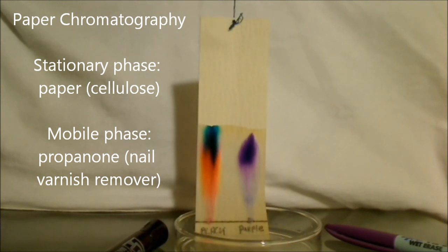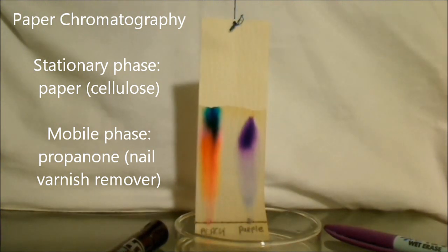There's a black ink on the left, purple ink on the right. You'll notice that the purple ink is really two different inks, light blue and purple, and the black is many different colors.